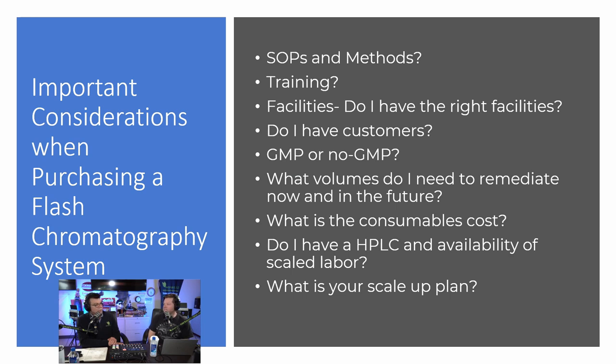And again, by rumor, you have to use water because there is no polarity between the 8 and the 9. Well, possibly that's the case. But I would also say that it's important that you look at it from a methods development standpoint and say, okay, I can develop a method that doesn't use water. So that would be the best thing.